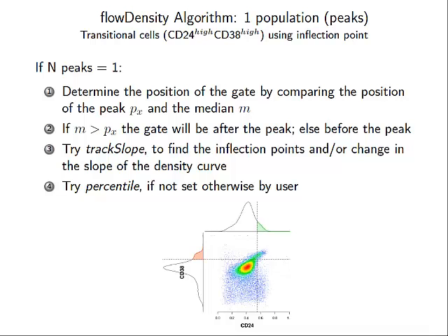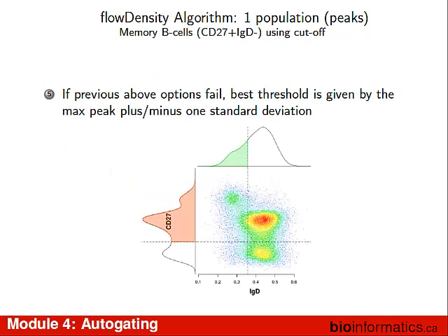So if you go back to the one with the three populations, that one. That's my pièce de résistance data set. That's the pattern that I'm seeing that defines something really, really important. But I don't get that dim population, the CD27 in your case, unless I have an FMO control. I've been doing data analysis of flow cytometry data since 2005. Do you know how many data sets we've gotten with FMO controls? Hey, bullshit.